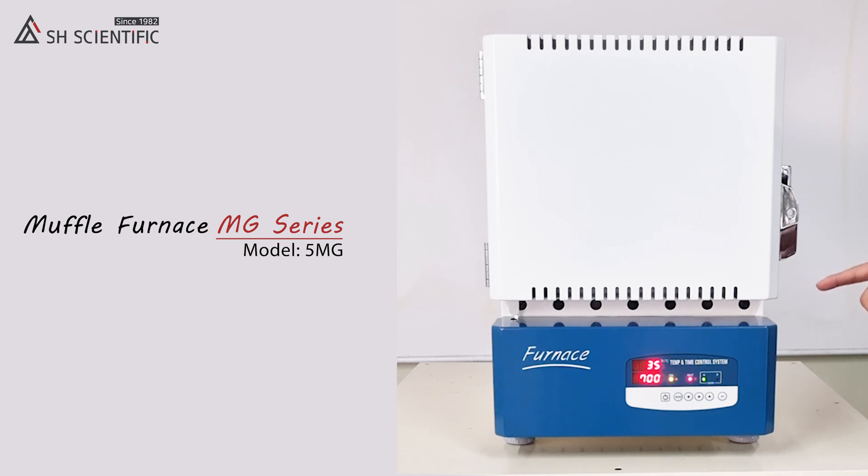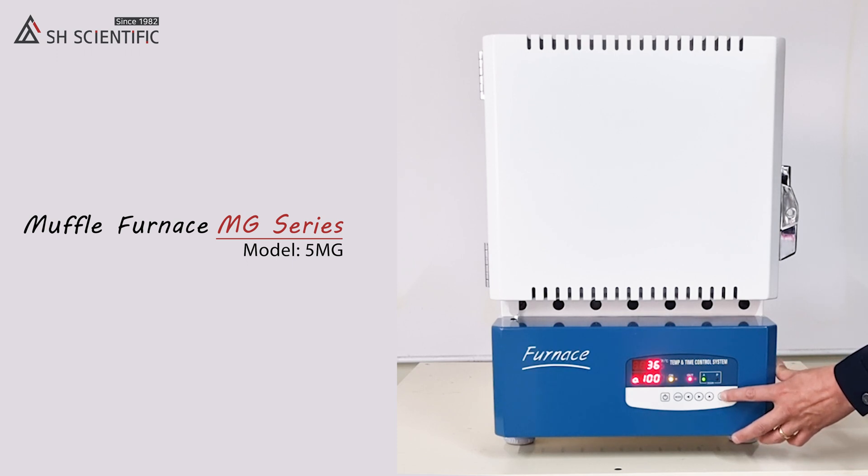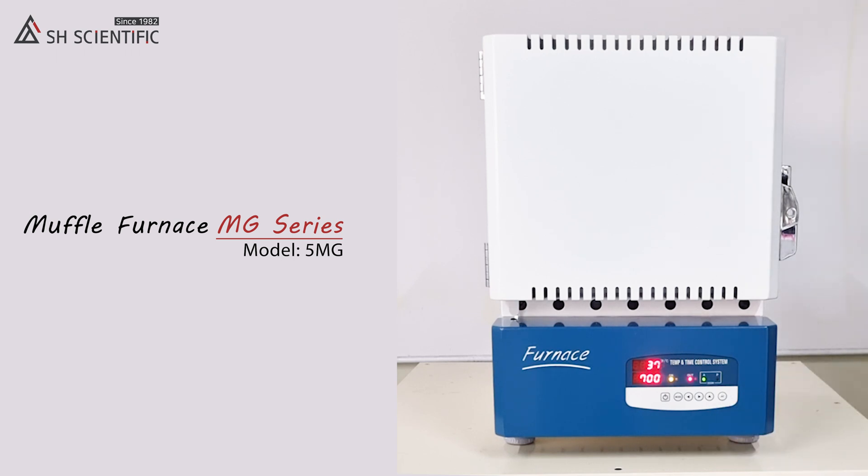Your set temperature will keep blinking until it reaches the set temperature. All of our furnaces have a neat troubleshooting feature called auto-tuning. It uses PID controls to automatically optimize the output of the heater and keep it from overshooting your target temperature. You can run auto-tuning either while or before running the furnace — just click the AT button and it will activate. It is best to try auto-tuning when you use the furnace for the first time or when you change the location of the furnace. If you encounter overshooting or temperature fluctuation, this feature will solve your problem easily.